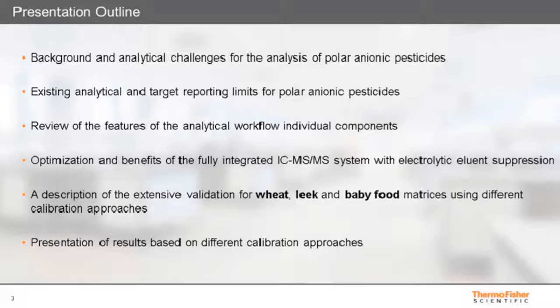We will review the features of each individual component of the analytical workflow, and we will discuss the optimization and benefits of the fully integrated IC-MS systems with electrolytic suppression of the eluent. We will then discuss the design and results of validation experiments using wheat, leek, and baby food matrices. And this will include presentation of the results based on different calibration approaches. And finally, we will give a short summary.